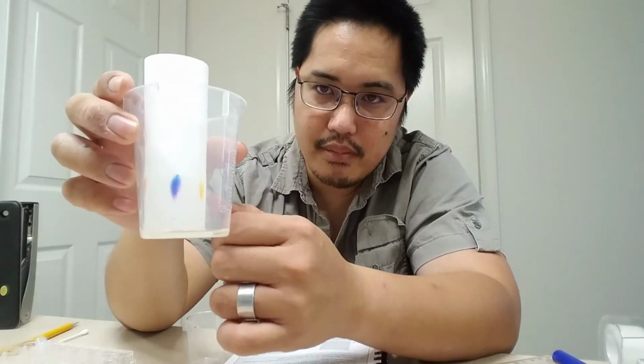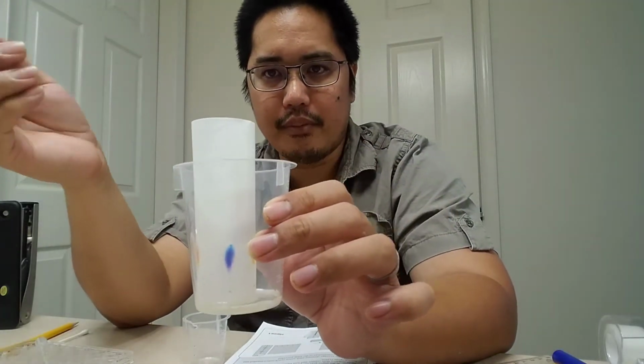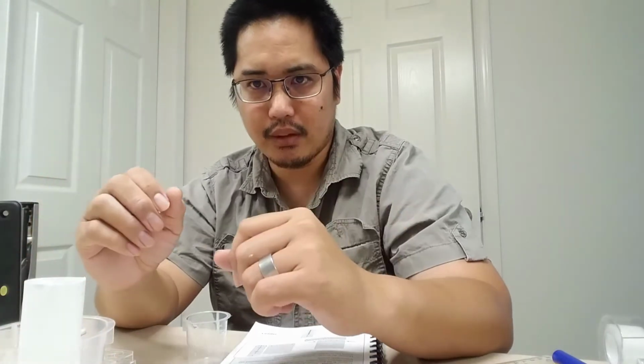And what you want to do is measure it. Now, some of you are going to ask me, well, where do I measure from? Do I measure the top of the dot to where the streak is? Or do I measure the bottom of the dot to where the streak is? Or do I measure the center? And my answer is going to be this: that's for you to decide. But I would recommend this: as long as you stay consistent.